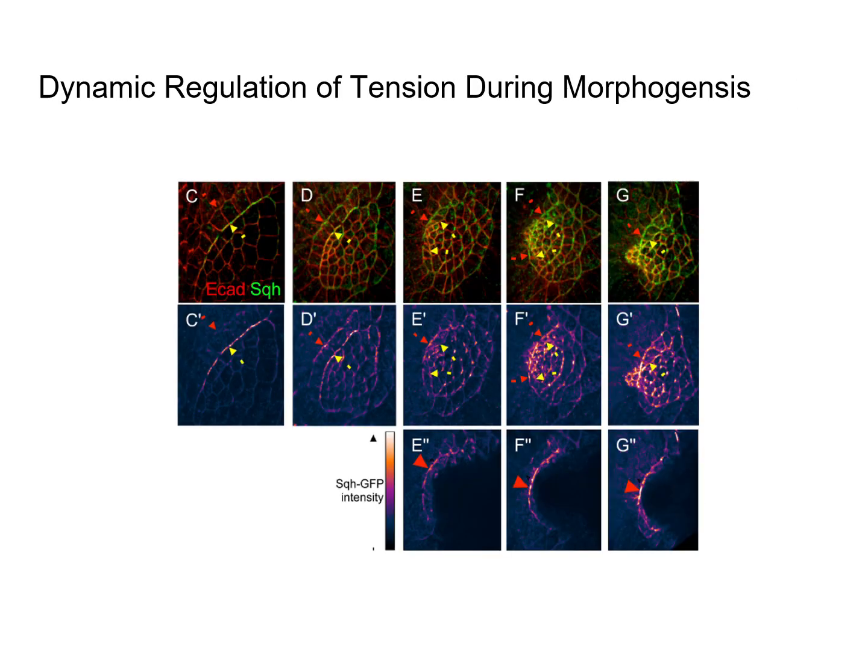As morphogenesis proceeds, the spatial distribution of SQH-GFP is not static. The later panels here illustrate that as the tissue begins to bend and cells initiate intercalations, the intensity of SQH along the floor-to-midline boundary reaches a peak near the site of active intercalation. This dynamic shift implies that the tension is being modulated in time to precisely orchestrate tissue remodeling. The clear correspondence between tension marker dynamics and morphological transitions strengthens the proposed model in which patterned apical tension drives the formation of three-dimensional structure from a flat epithelium.